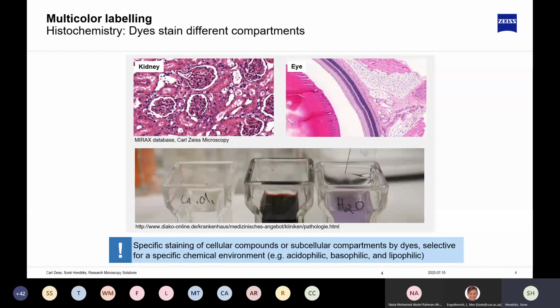The main limitation of basic histochemistry is that you always have to work with fixed samples, paraffin embedded, thinly sliced. So the sample preparation is fairly routine, and you always see some sort of expected outcome when you do this type of staining. And it's quite useful for especially pathology customers, so that they could then see or identify abnormalities in tissues.